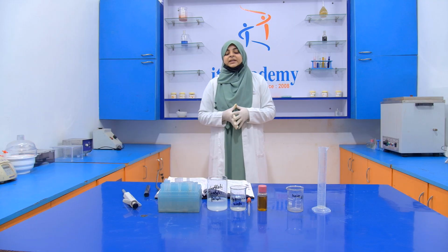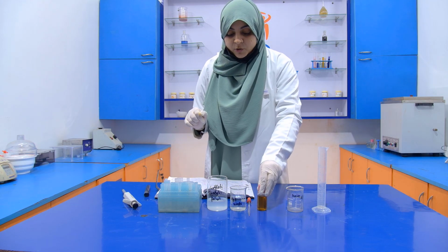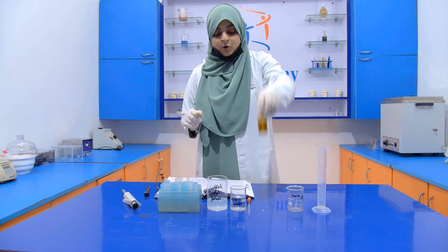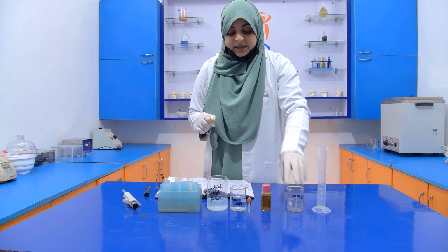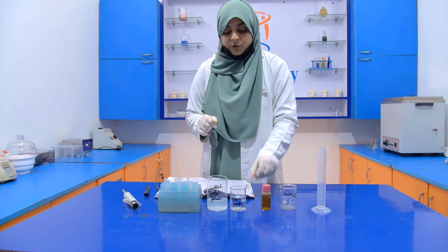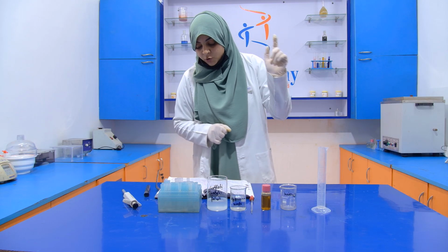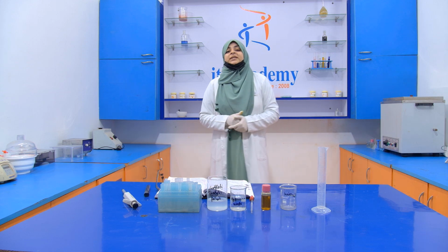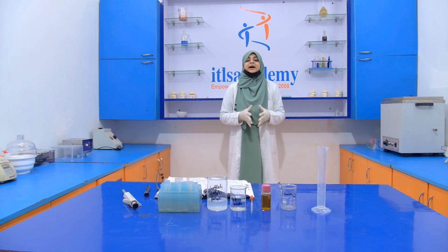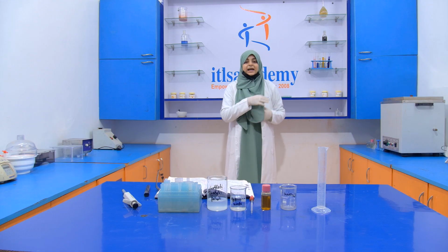For performing this experiment, we require this setup. First of all, we require oil as a sample. Then we require a beaker, a measuring cylinder, a dropper, hot water, and alcoholic potash. So what is alcoholic potash? It is a chemical reagent which is used to perform this experiment.